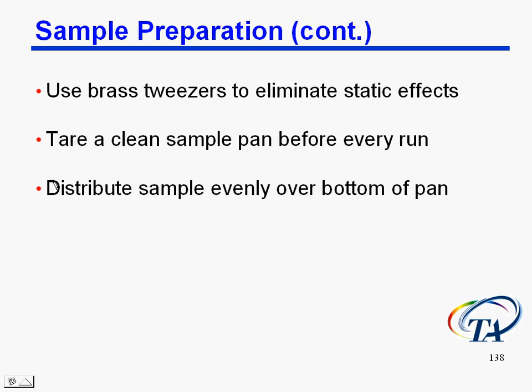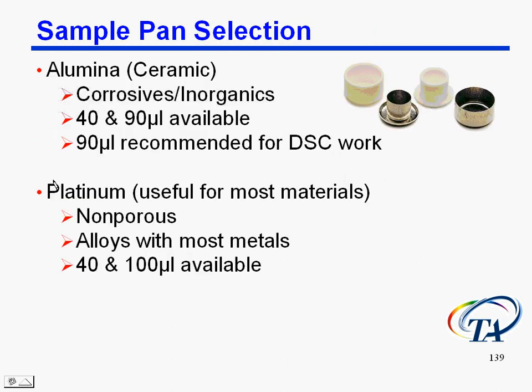Other tips: you might want to use brass tweezers to eliminate static effects. You want to make sure you tare a clean sample pan before every run, and then distribute the sample evenly over the bottom of the pan. Now here are our different sample pans.